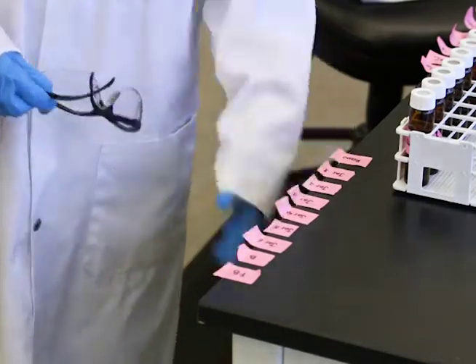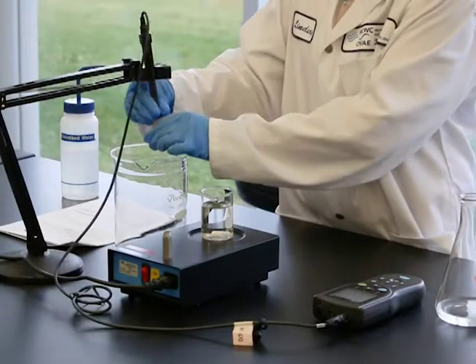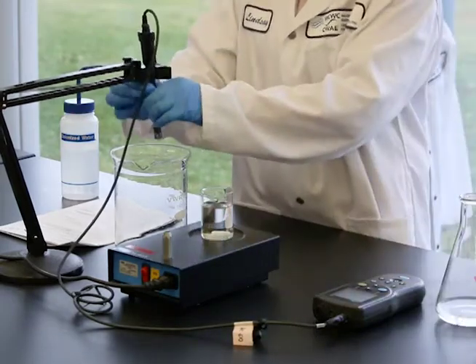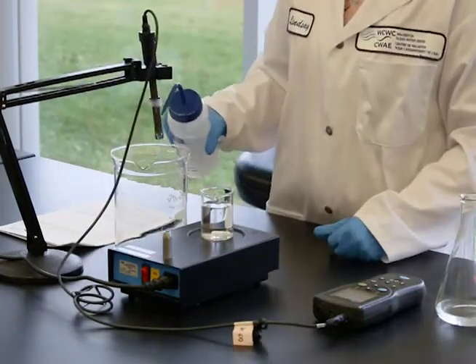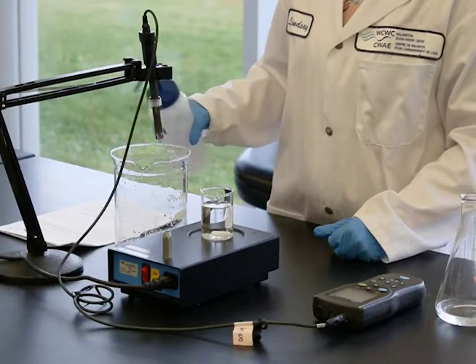We will be using a Hawk HQD meter with an IntelliCal probe for our demonstration. Remove the probe from the pH storage solution. Rinse the probe with deionized water and dry it with a lint-free wipe.